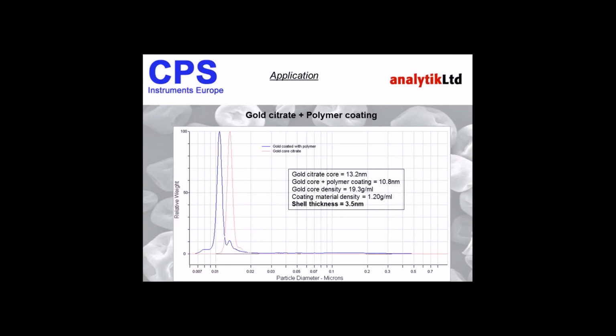However, we do have algorithms present whereby if you know the density of the core material, if you know the density of the coating, you can actually use that to determine the shell thickness.